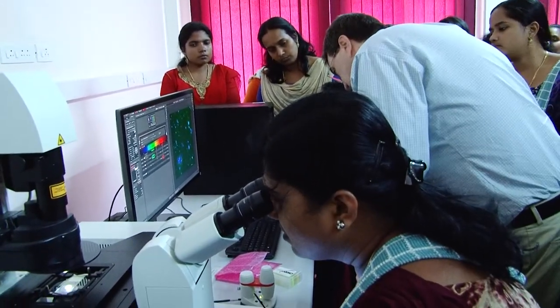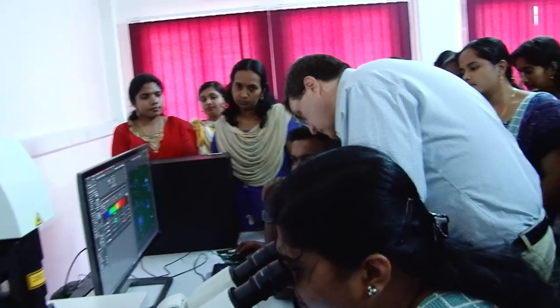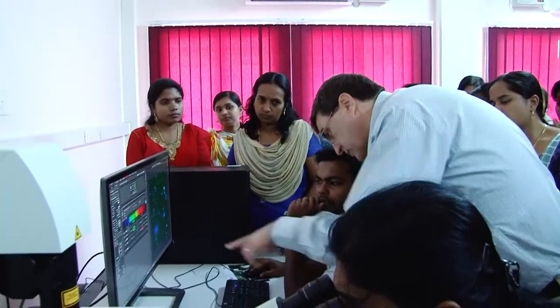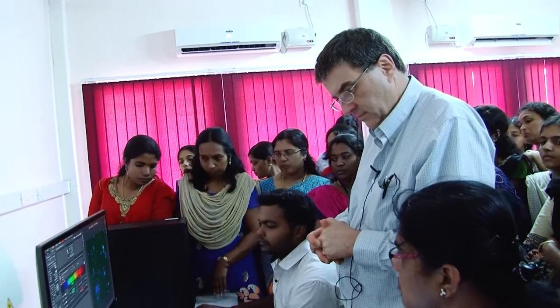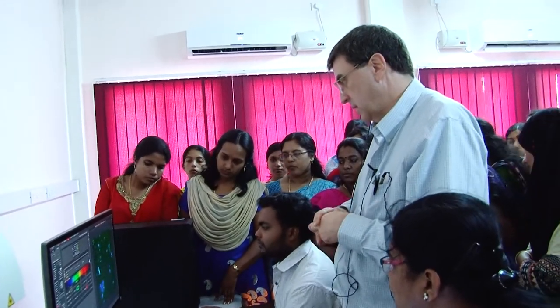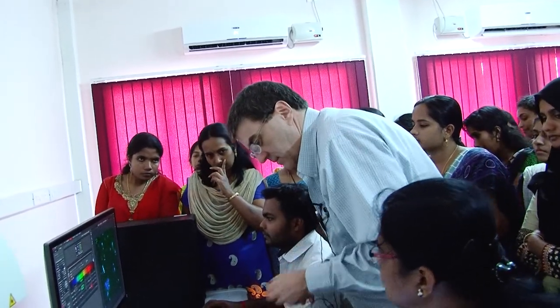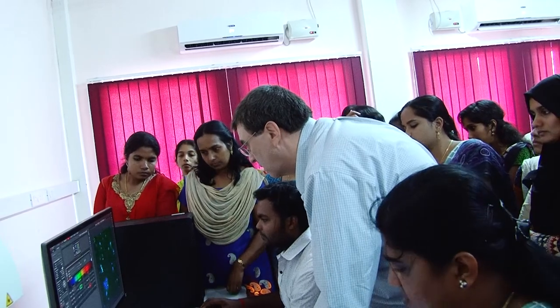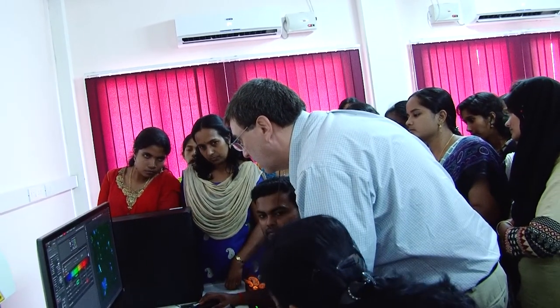So what we'll do this time, we'll do the same thing. You do a stack, and then we'll pick it, and then we'll turn confocal again. Okay? Pretty close to the same. Let's just move over just a little. Try something a little different. Stage move, the move change.